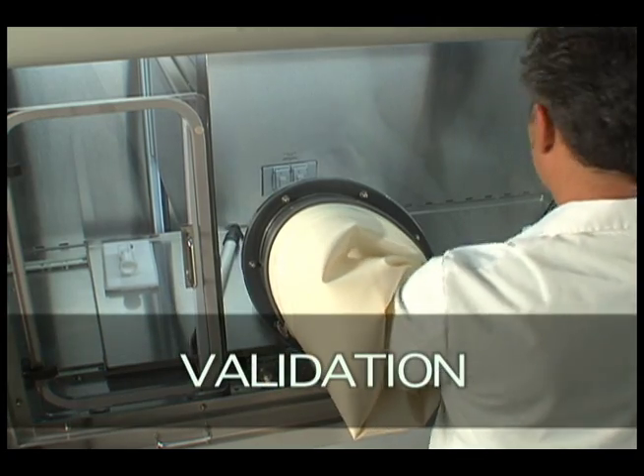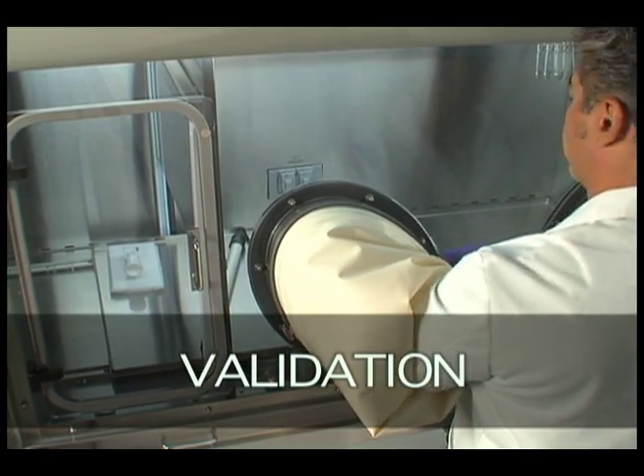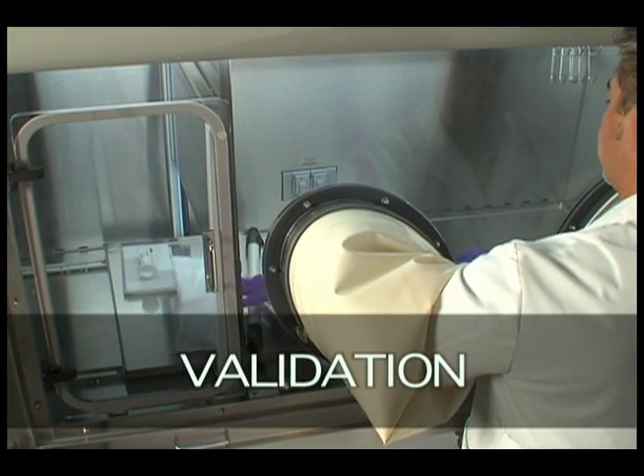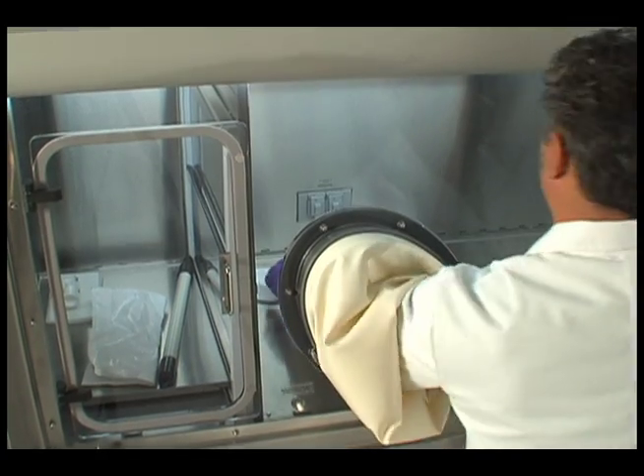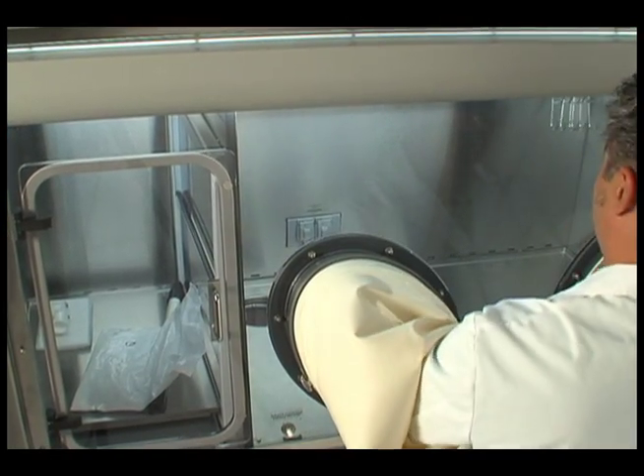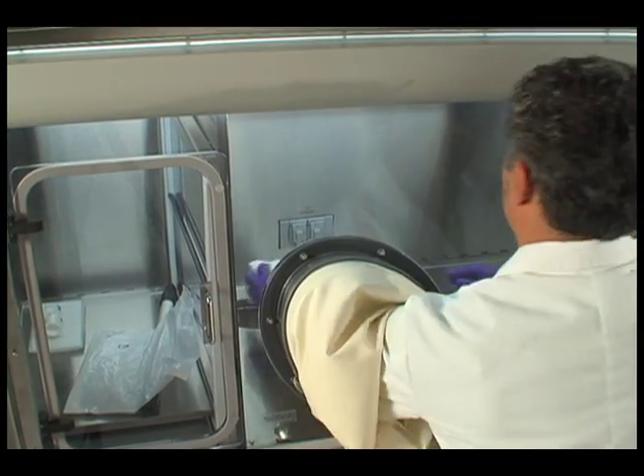Validation: As some facilities dictate, you may need to validate each completed cleaning procedure. Samples taken with sterile swabbing may be required to ensure no cleaning or disinfecting agents are present on the isolator's interior surfaces.